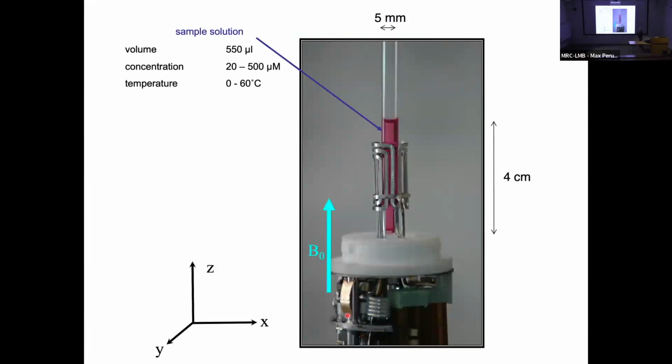The business end of the NMR machine is referred to as the probe, and it's a detector coil. So at thermal equilibrium, the magnetization from the samples, these nuclear magnetic dipoles, are all going to be pointing directly up the vertical axis of this NMR tube. So the NMR tube itself is a glass tube. It has 5 millimeters external diameter in this case, and we never open the NMR tube while it's in the spectrometer, so we don't get cross-contamination between components. You can take your sample back afterwards. NMR is non-destructive. As long as the sample's stable, you get the sample back at the end of the experiment.